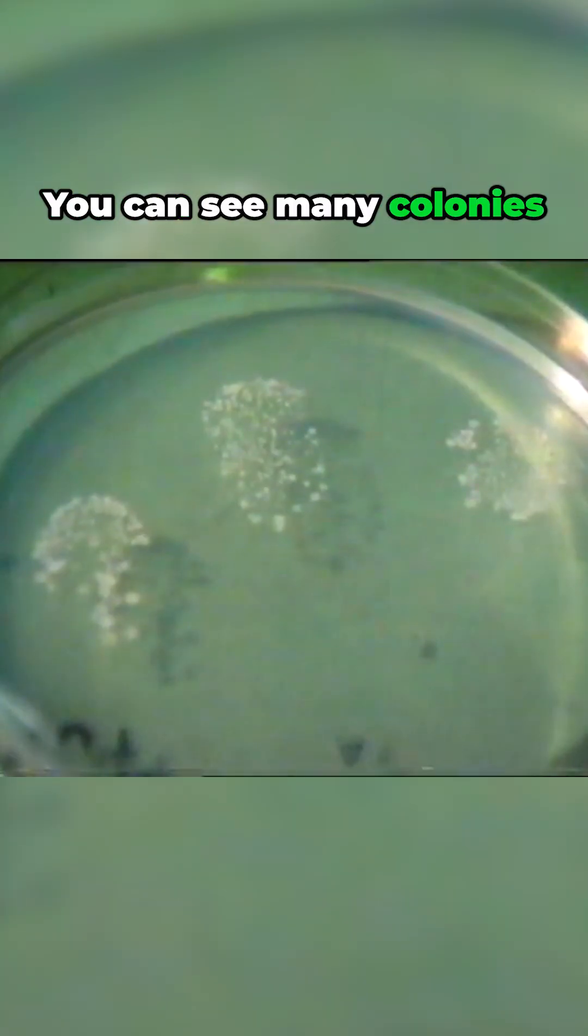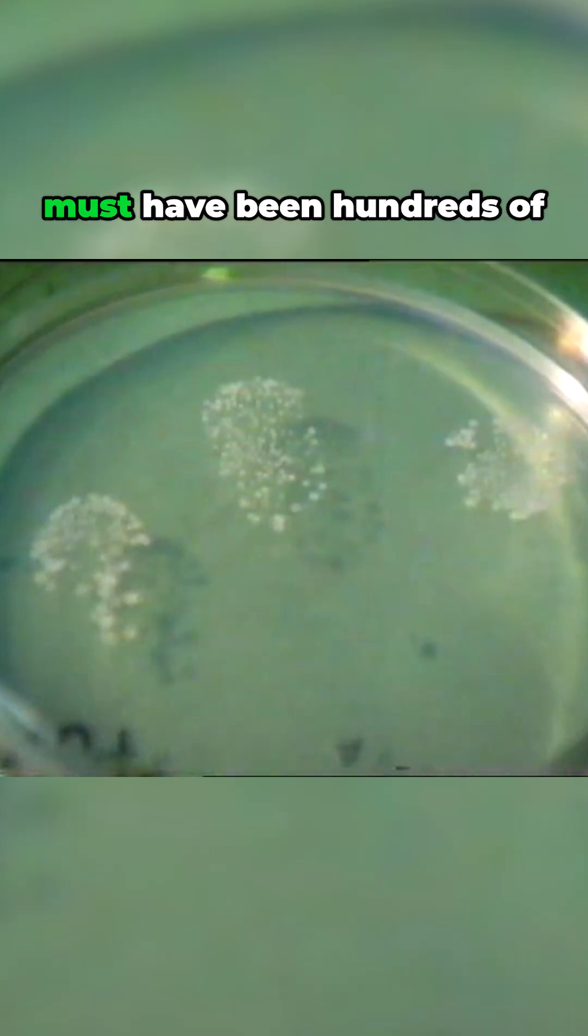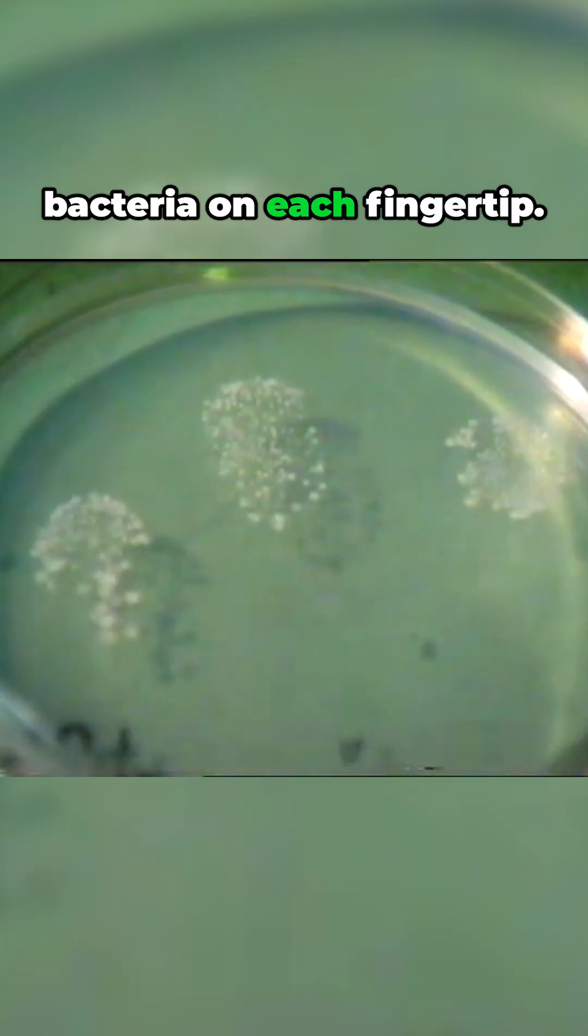You can see many colonies of bacteria showing that there must have been hundreds of bacteria on each fingertip.